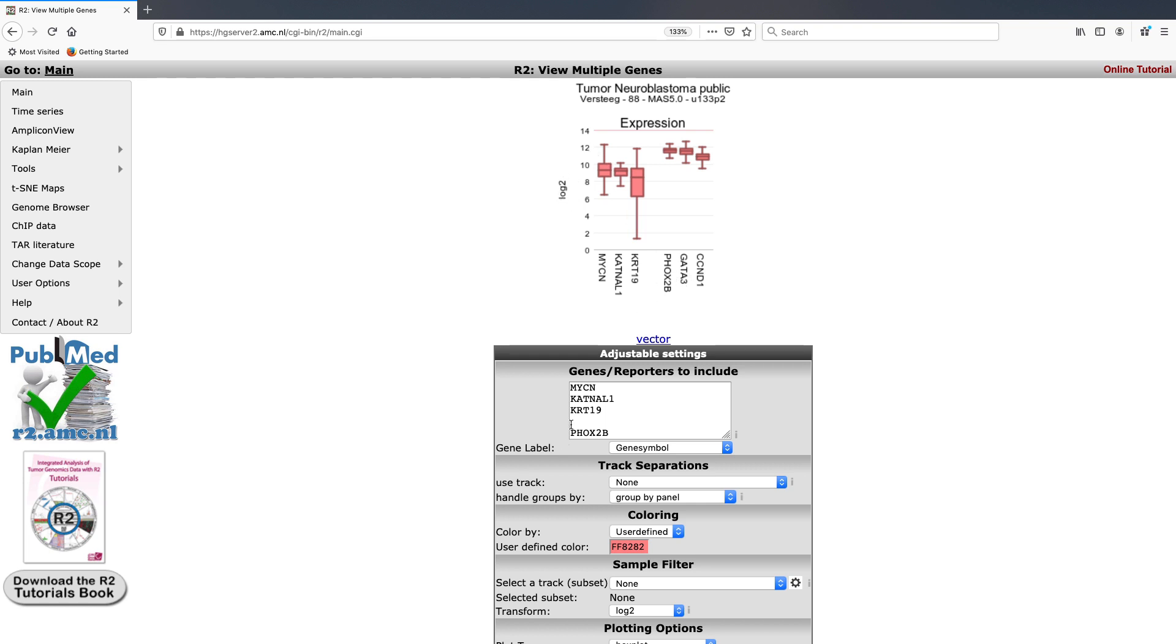As you can see here, the space that we left on the line in between the different panels of genes does show up separating the two groups of genes on the plot itself.